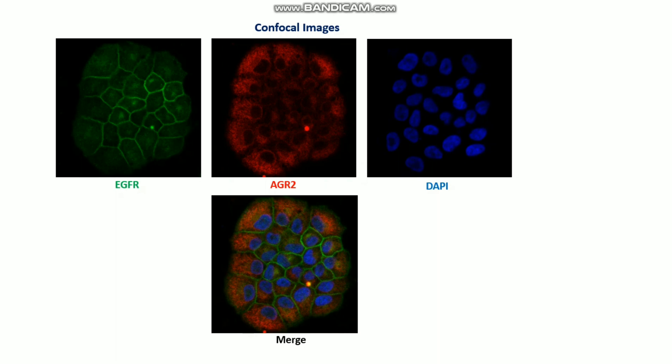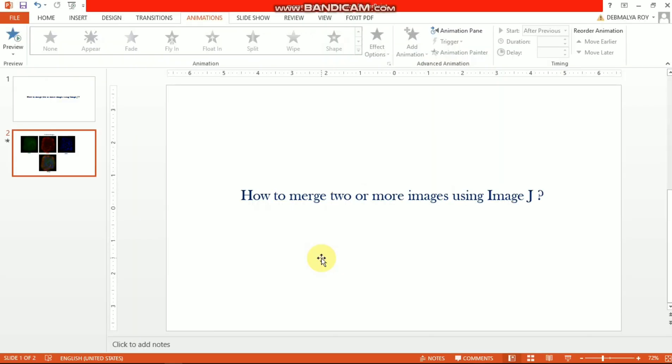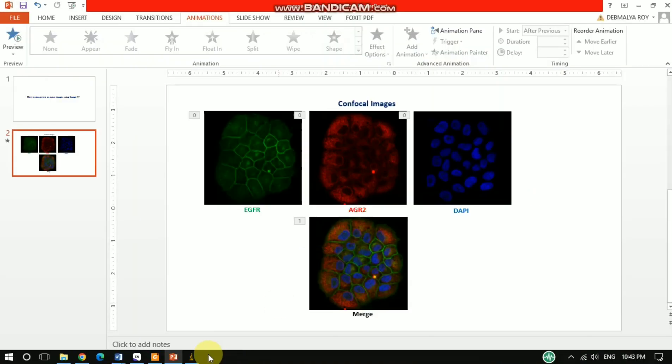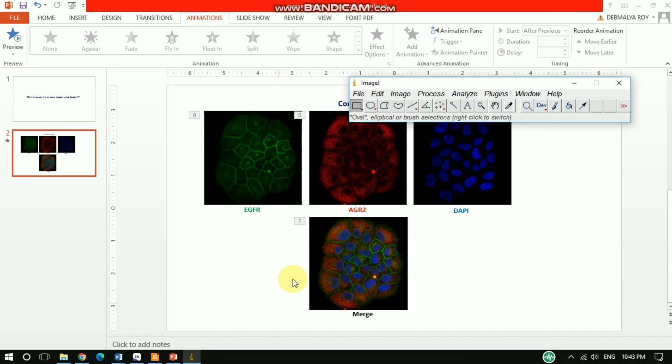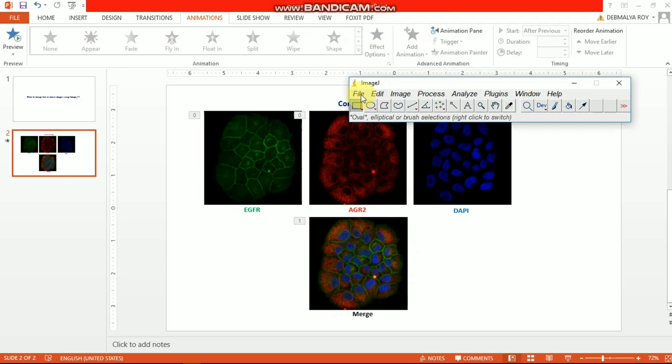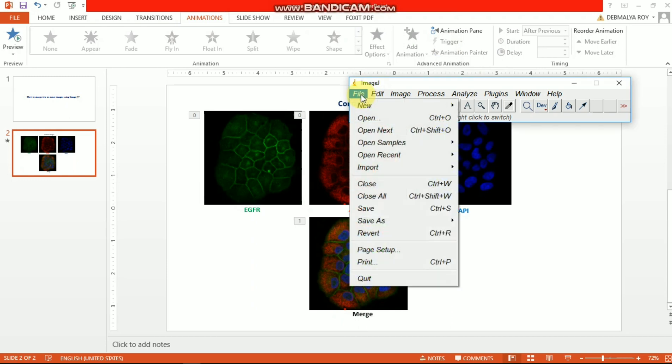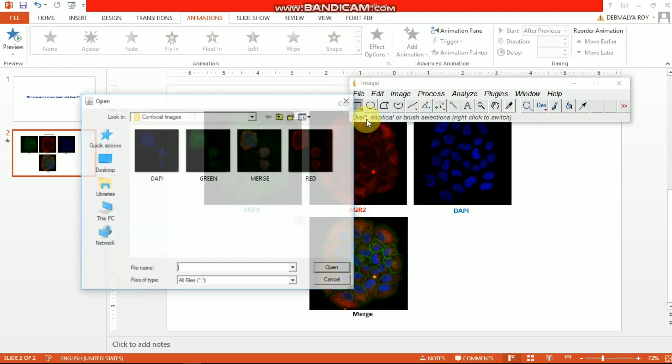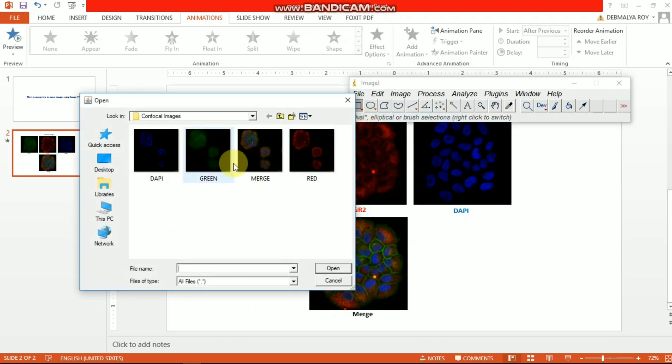First you need to open your software. I already opened the ImageJ software here. Then you need to open your images. I already renamed my images like DAPI, green, and red, which is pretty useful when you select these pictures.